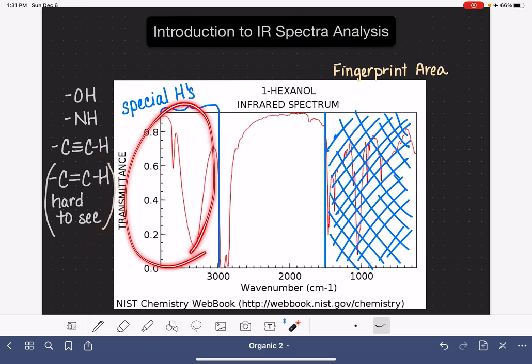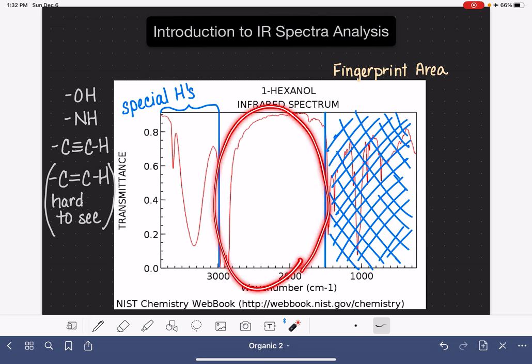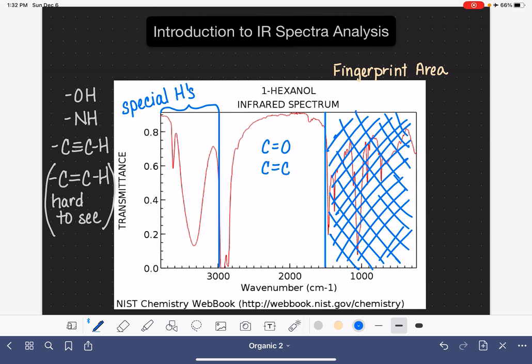So once I've analyzed the area of the special hydrogens, then we're going to turn to the area in the middle of 1500 and 3000. This is where we find our normal functional groups like the carbonyl group, the carbon-carbon double bond, the carbon-carbon triple bond, which as a reminder, you may not be able to see because it might be invisible to the IR if the molecule is symmetric. And also here we can find carbon-nitrogen triple bonds as well.